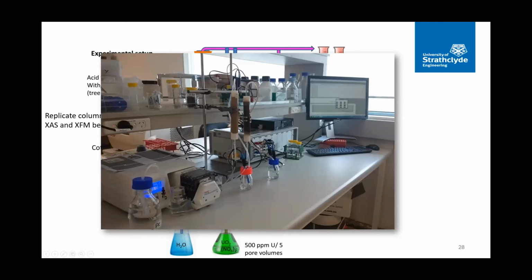This is just plain salt solution at the moment. It got more complicated, basically, with adding the fraction collector and the uranium solutions afterwards, but it's probably easier to see it more simply. And then behind there are my probes detecting the outflow.